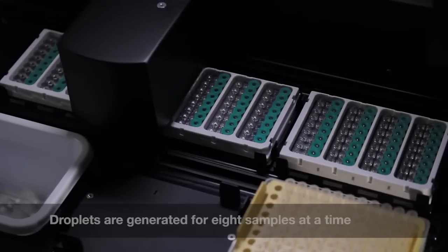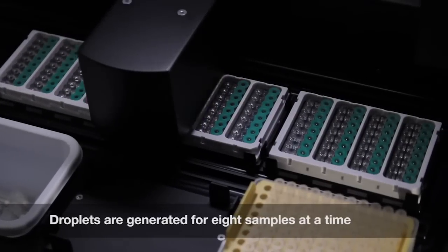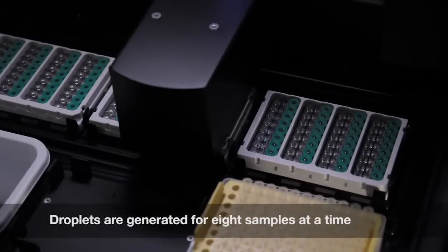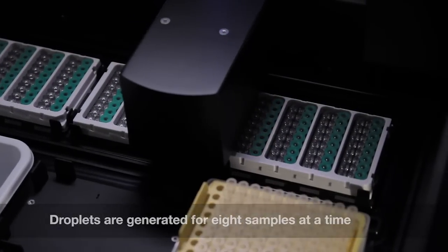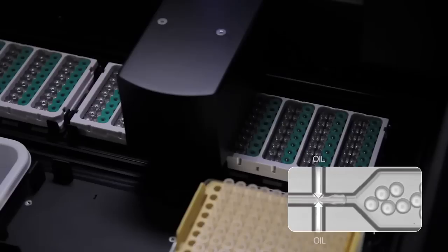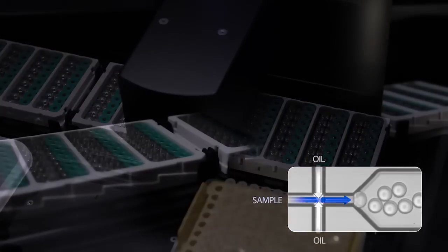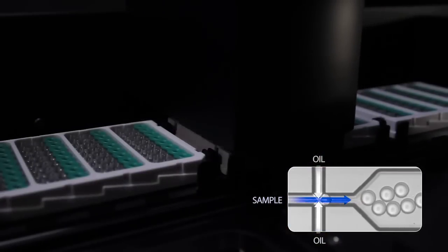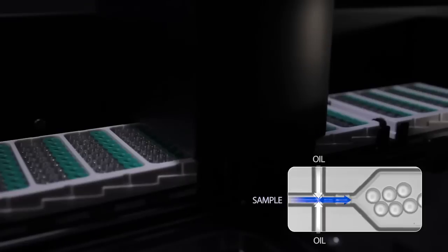Oil and samples are combined in the microfluidic channels of the cartridge to create uniform droplets in which nucleic acid molecules are distributed in a random fashion.